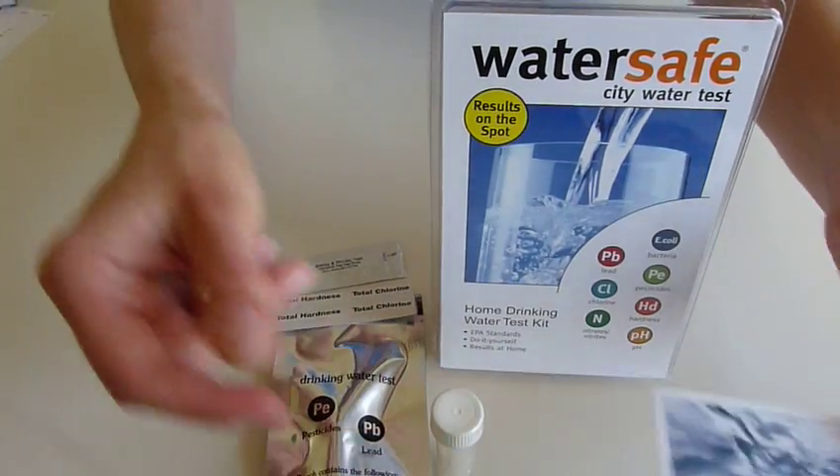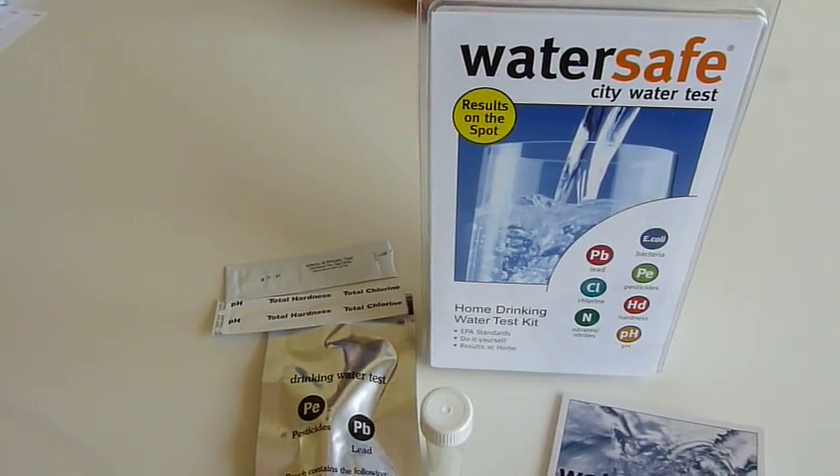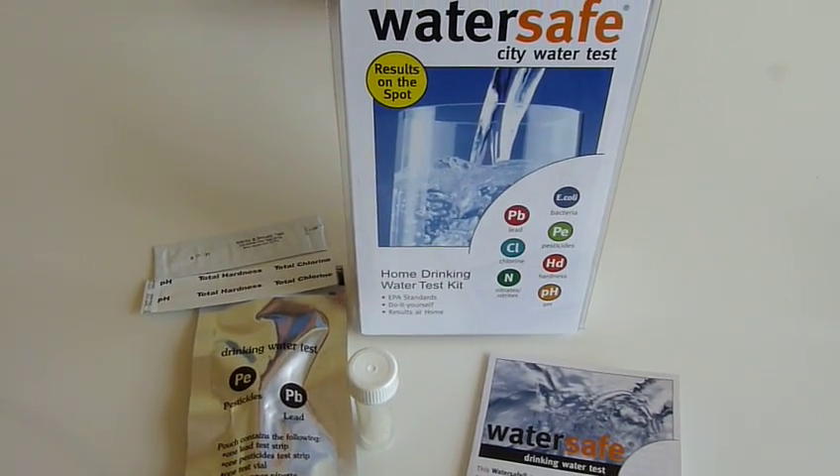This test kit has been developed to EPA standards, which is the US standard from the Environmental Protection Agency, and this is comparable to the EU regulations.